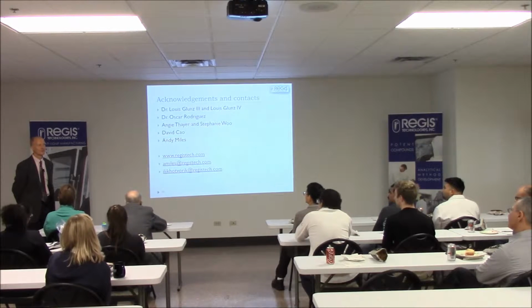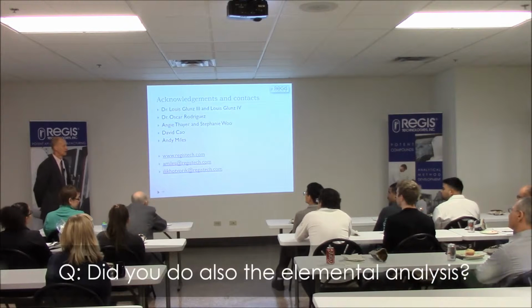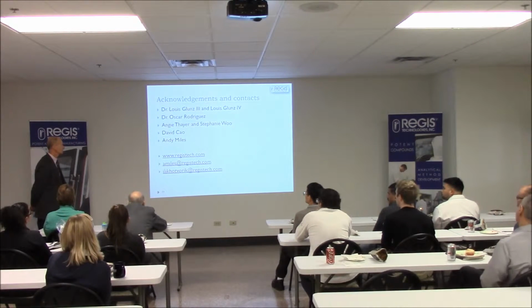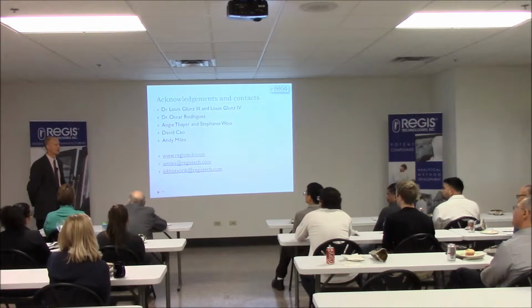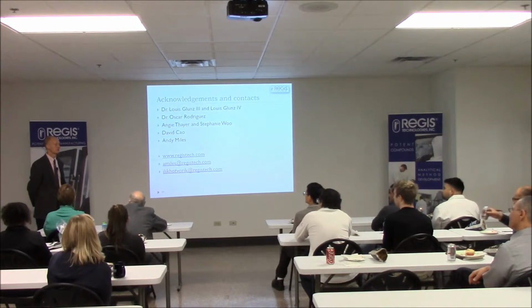Did you do also the elemental analysis? It's not necessary in most cases. Whatever you saw here was just done by using mass spectral data. And in these cases, because the molecules were quite simple, we didn't even use high-resolution mass spectra. But if you use high-resolution mass spectra, it would actually replace your elemental analysis because you will have a good clue on your molecular composition.